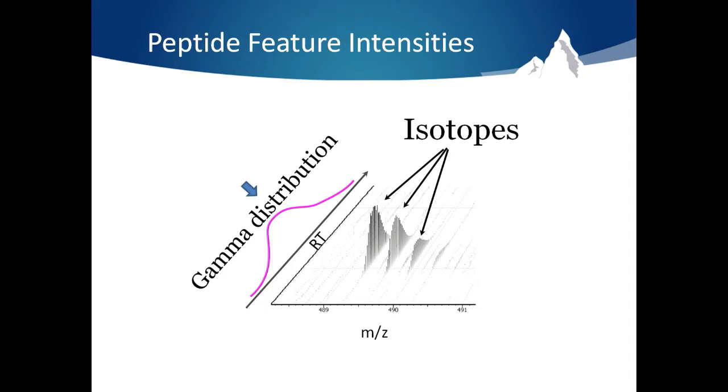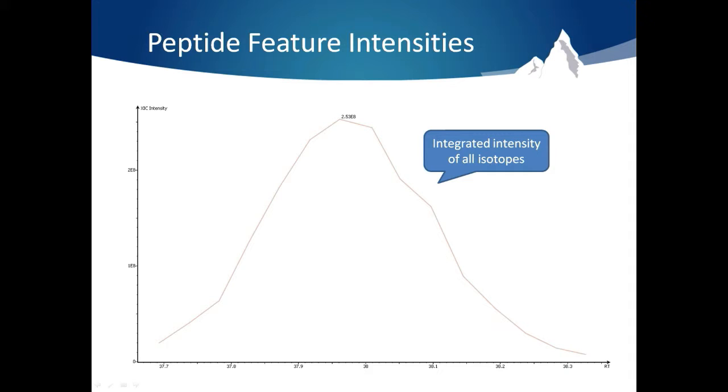PEAKS will automatically detect these peptide features and calculate the area under their retention time curve. It will include the area of all isotopes associated with the feature within 5% relative intensity of the most intense peak. These areas are then integrated into the XIC curve shown here. From this the area under the curve can be easily calculated.